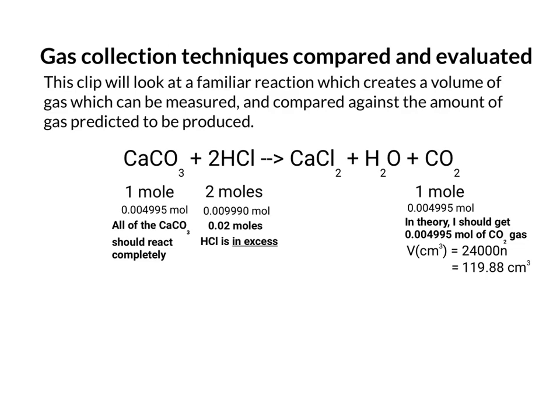So the measurement of CaCO3 earlier, the 0.5 grams, I did that twice. So I've actually got two weighing boats with exactly 0.5 grams of calcium carbonate in them. And one is going to be used for one gas collection technique. The other one is going to be used for the other.